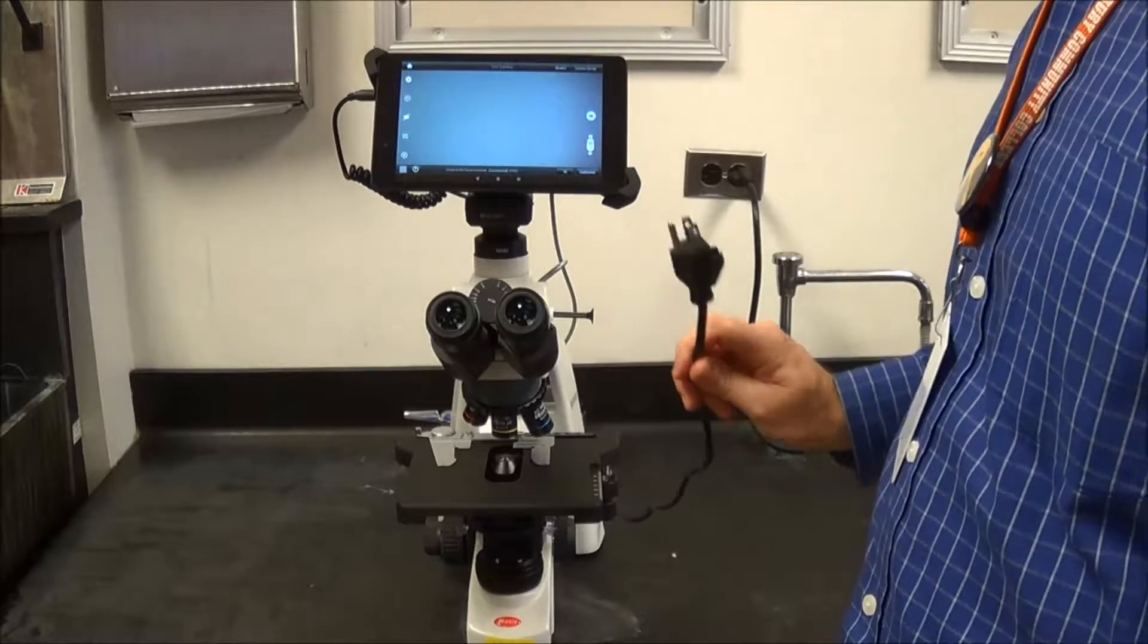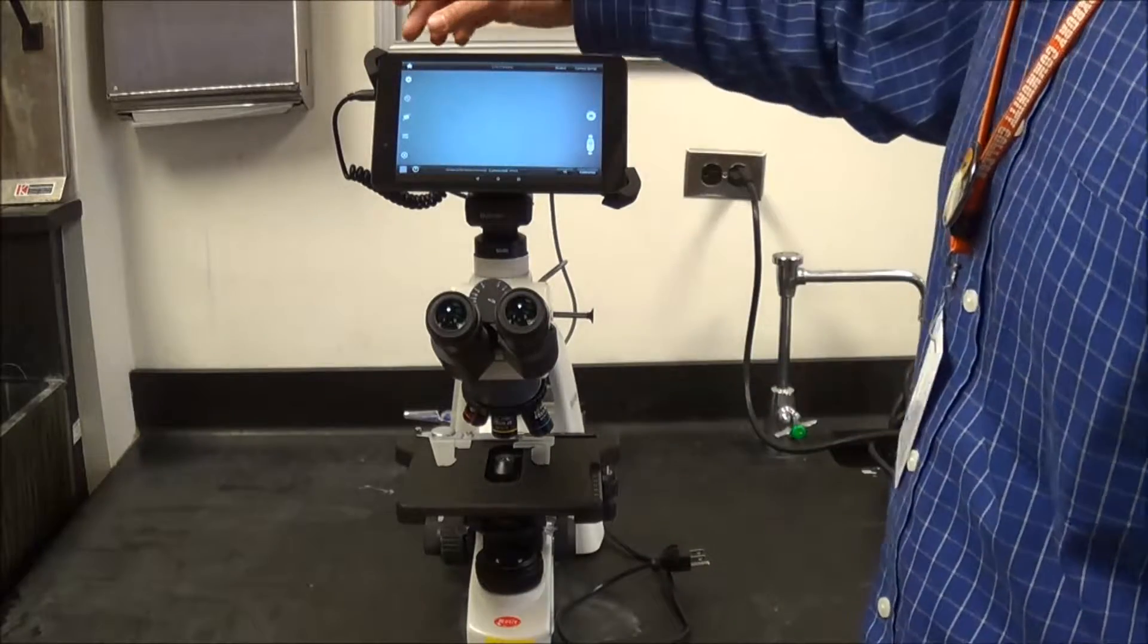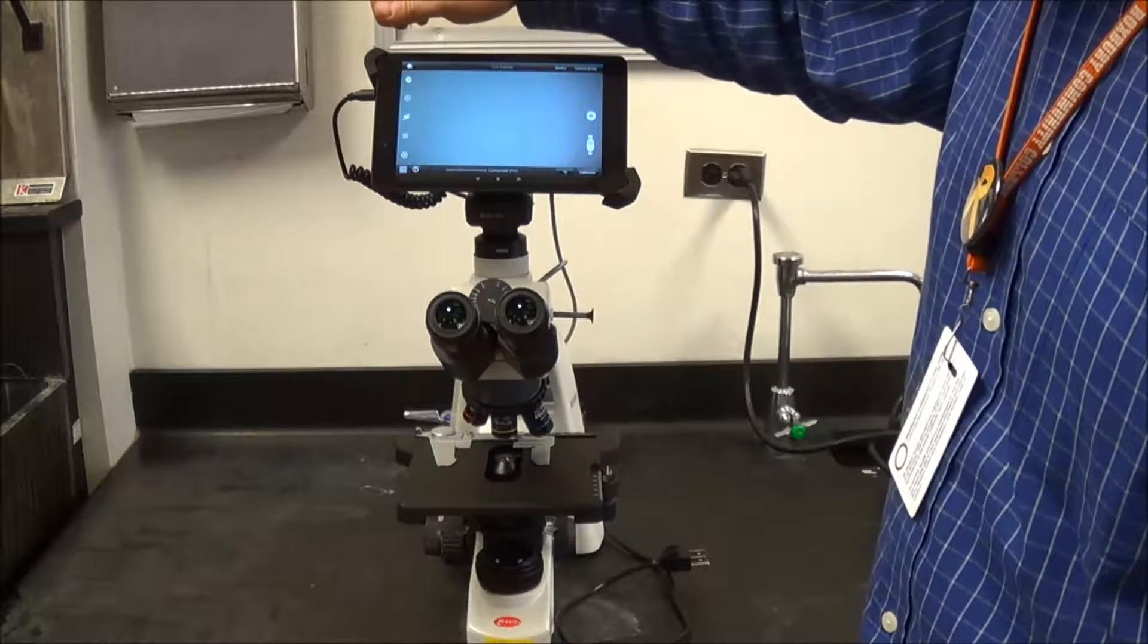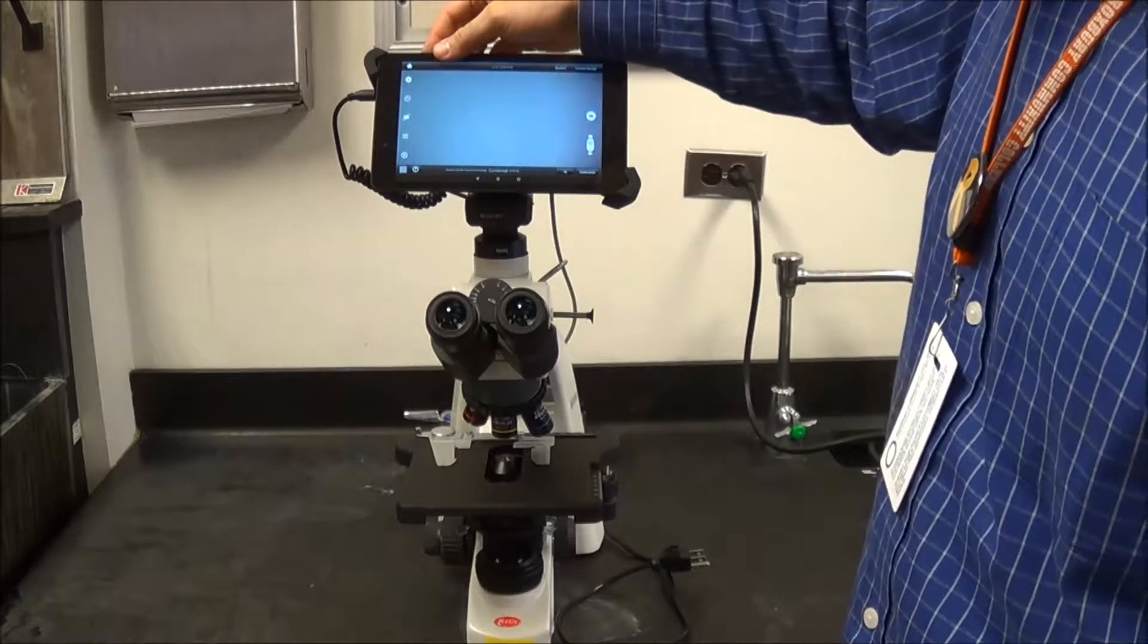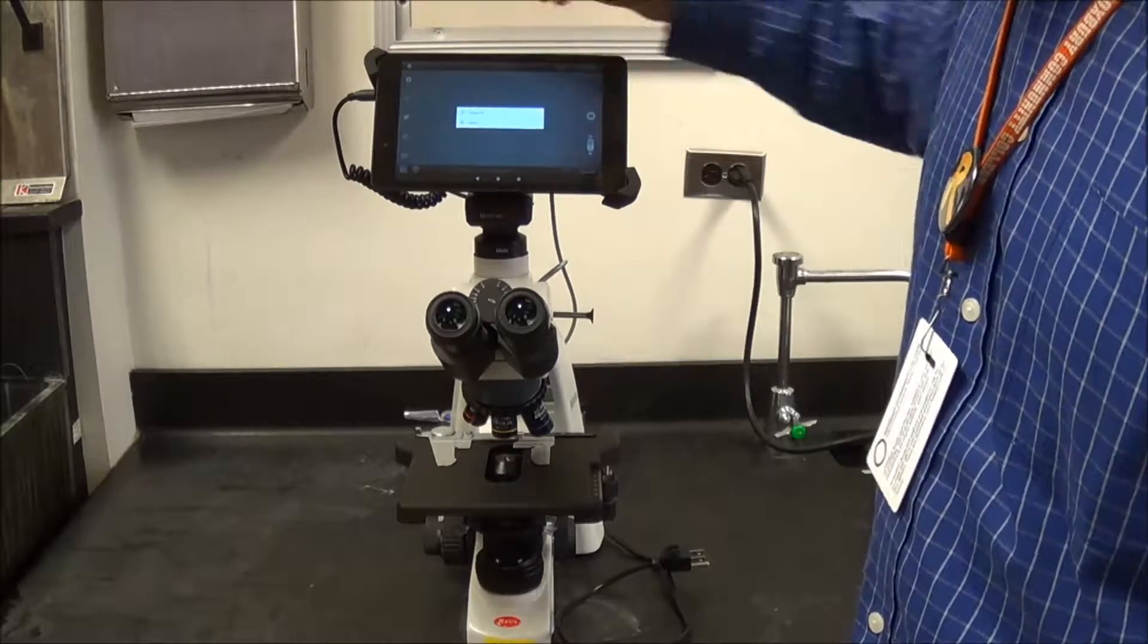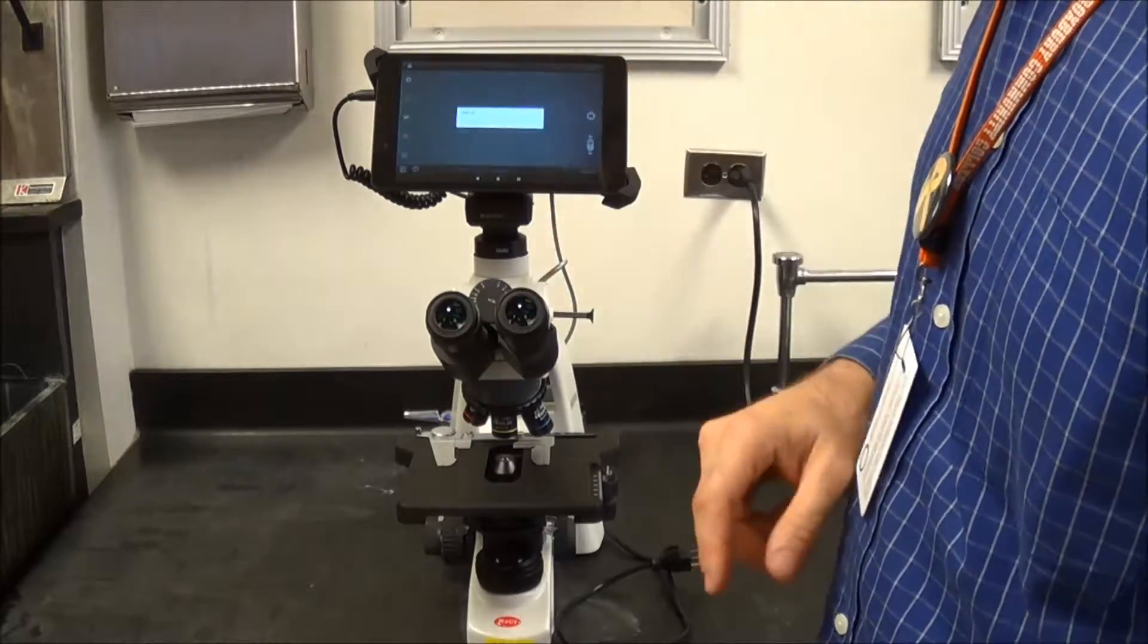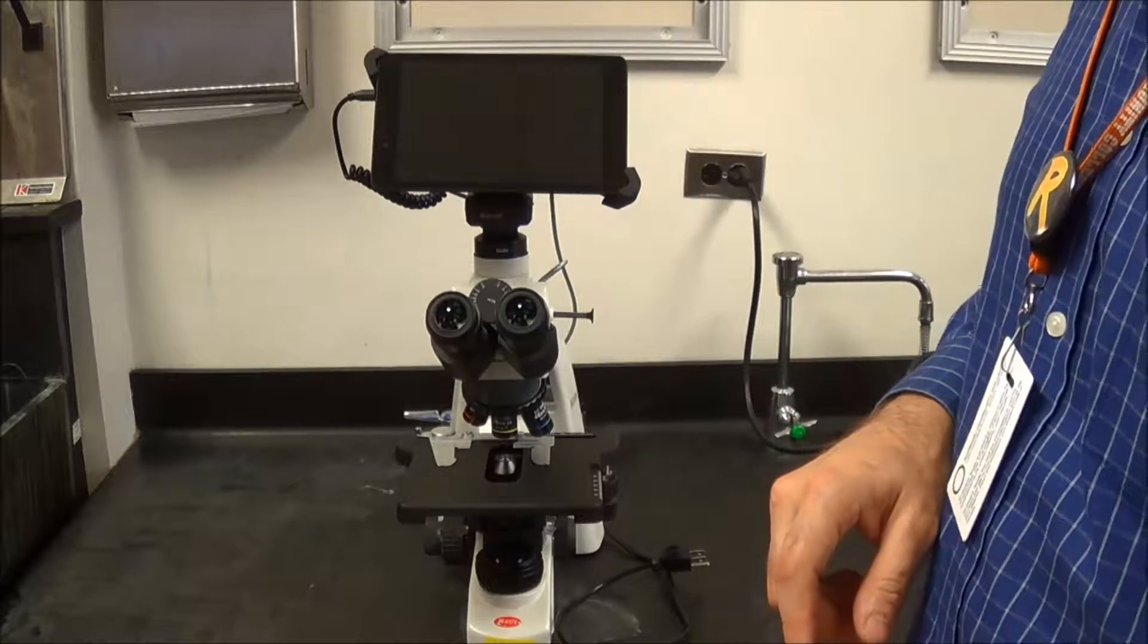We want to unplug it and then hold down that power button again. Remember, it's the button most to the left in the upper corner. As you hold that down, you get the option to power off or reboot. So you want to press power off and turn it off.